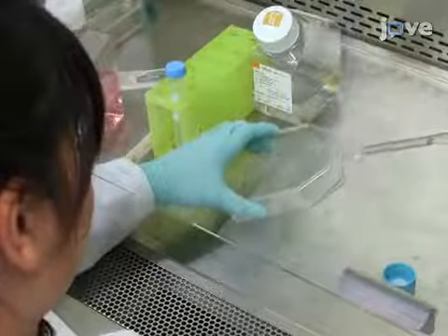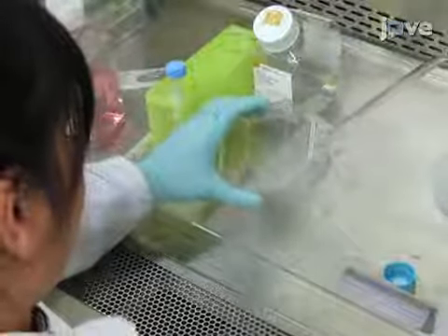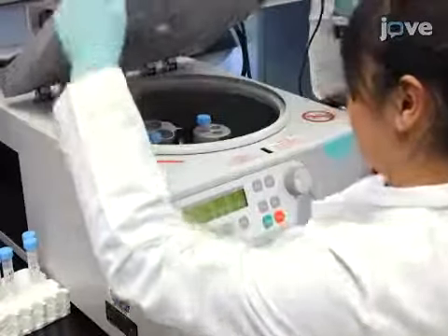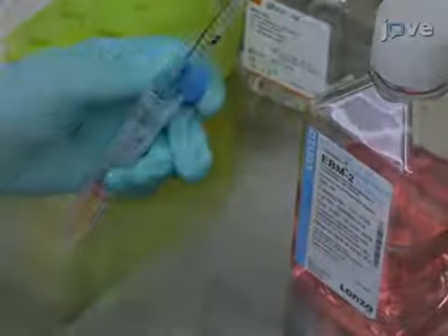Neutralize the trypsin by adding 5 milliliters of EBM2 complete medium. Collect the cells and centrifuge at 290 times G for 5 minutes at 4 degrees Celsius. Following centrifugation, discard the supernatant and resuspend the pellet in EBM2 complete medium.